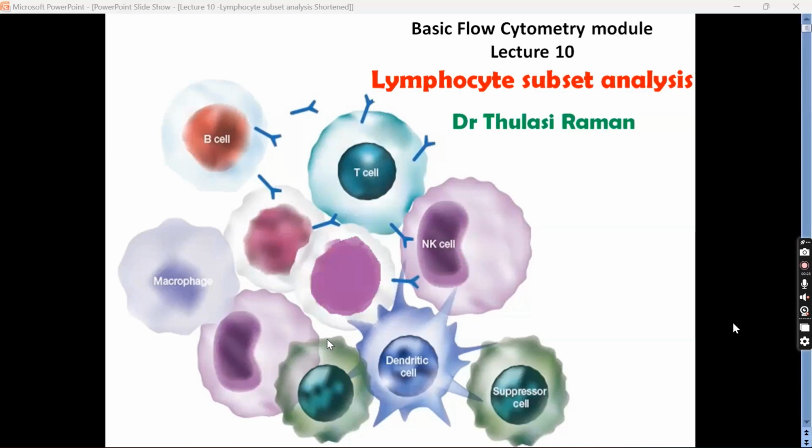So I just showed you a case in analysis. Possibly I didn't show you a live analysis because there's nothing to show as a live analysis. Basically, what you need to do is just gate your lymphocytes and check whether it is positive for HLA-B27 or negative for HLA-B27. As simple as that.